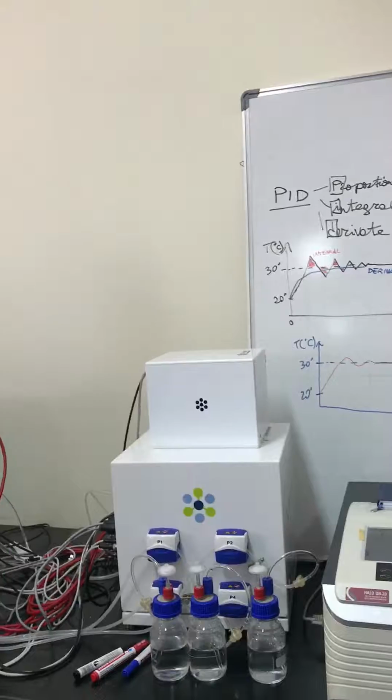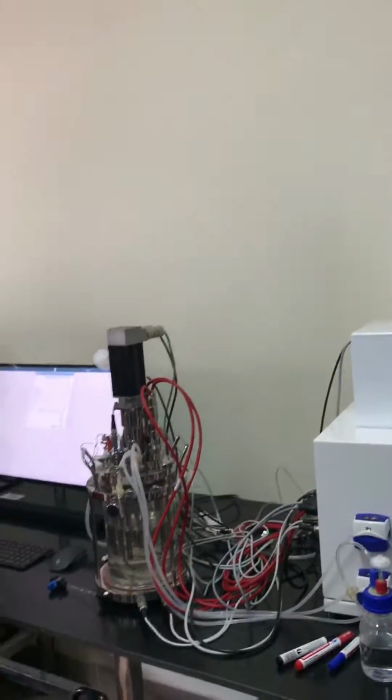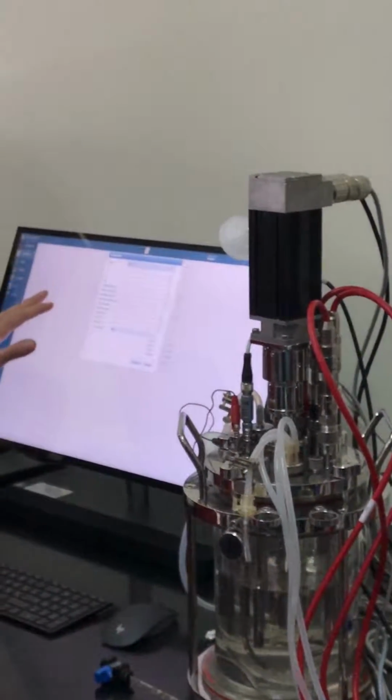Okay. And here you will see all the parameters, the mathematical parameters to control, but they are ready to go like this.